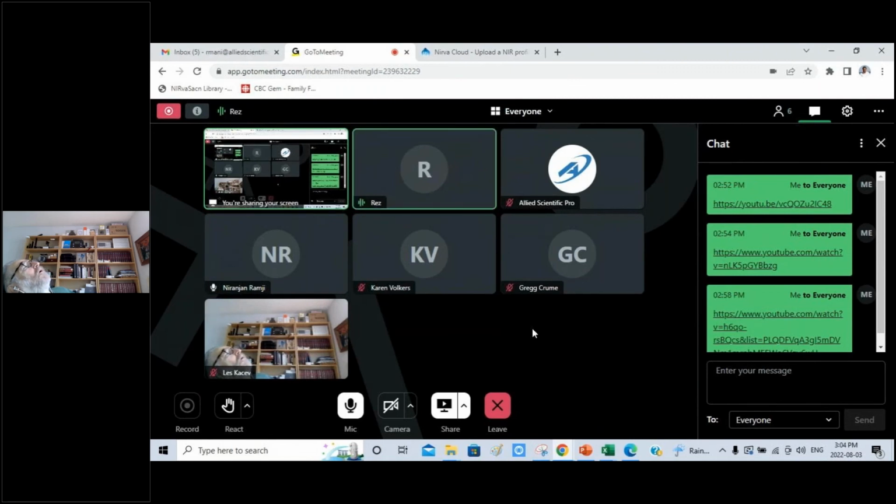So also you said in the cuvette, what is the volume of sample that you need for the liquid samples? It's not that much, really. The cuvette is 1 centimeter by 1 centimeter by, say, 5 centimeters. The height of it is 5 centimeters. So I would say if you have maybe 2 centimeters of liquid, so about 2 ml, it's enough because the source is at the bottom.